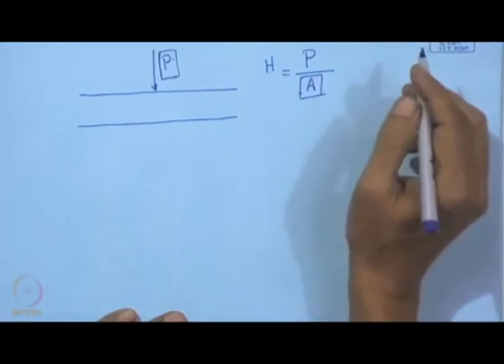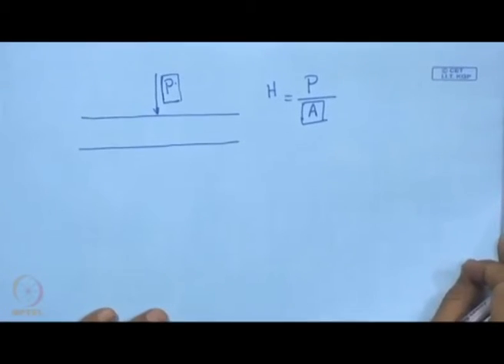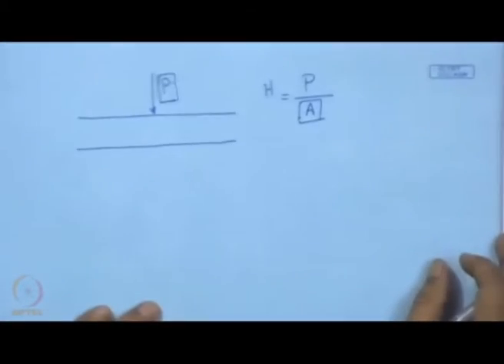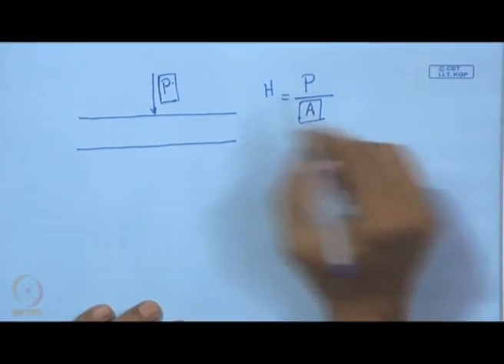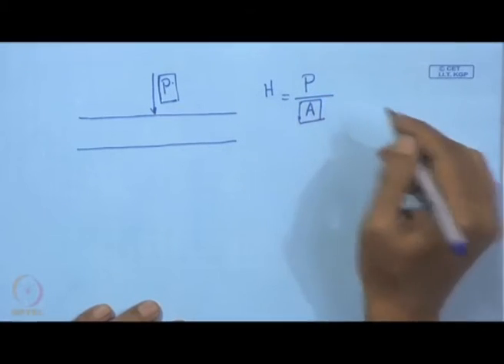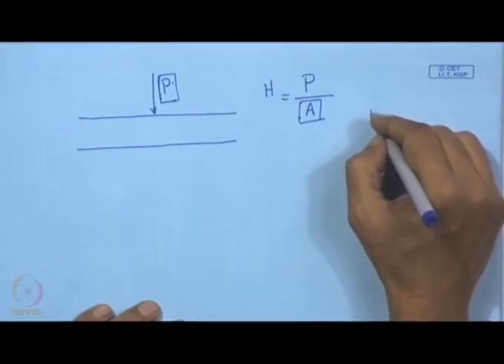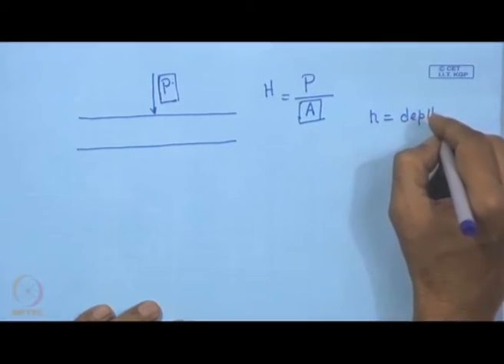We measure the diameter of the indentation or the diagonal length of the pyramid. However, in this case we measure the depth of penetration.